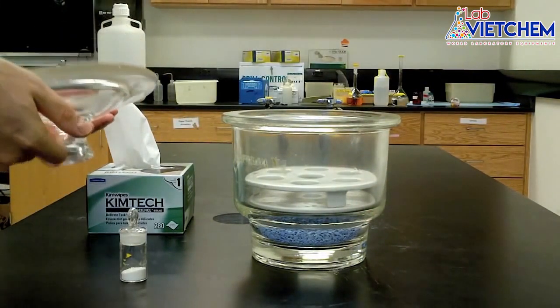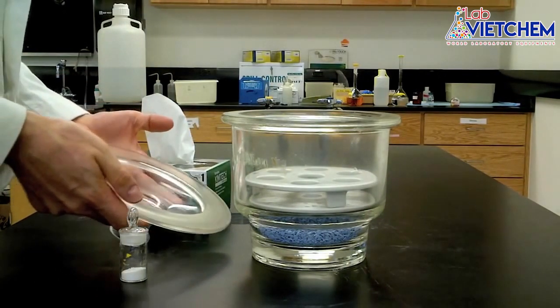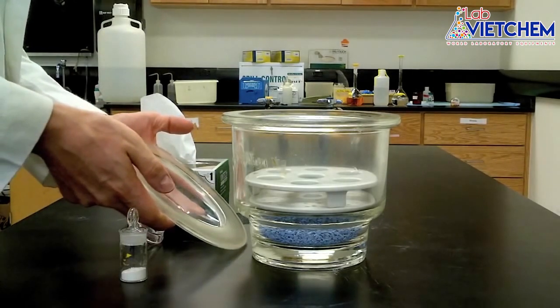You don't want desiccator parts flying all over the lab. Once the lid is off, place it on the bench grease side up to keep it clean and avoid dirty looks from your TA.